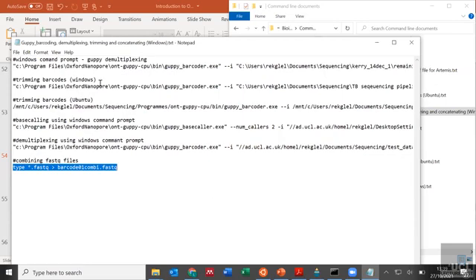I think that says Windows. However, I think it might be an Ubuntu command or a Linux command. It might work on both. I can't remember now off the top of my head. I think I used Windows. I actually managed to do it myself with concatenating, but it felt so easy. I was like, this must be wrong. But I think yeah, that's fine, actually.